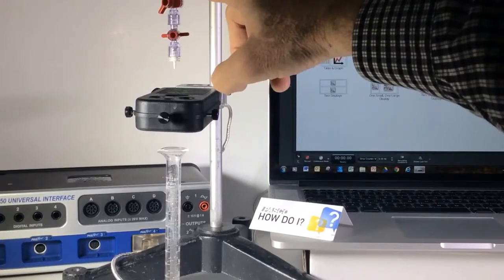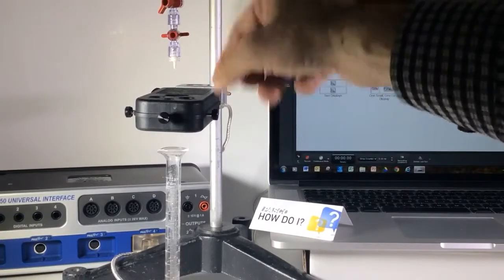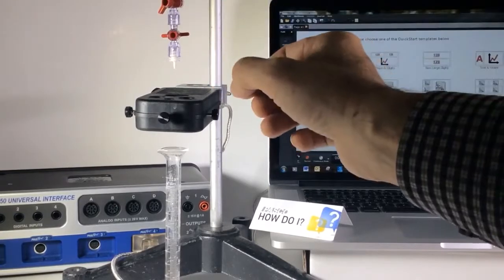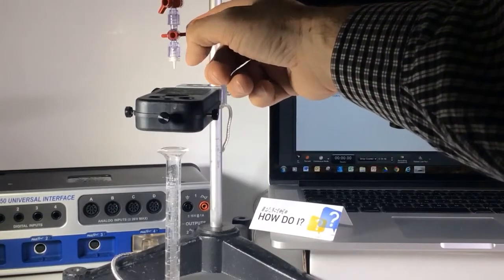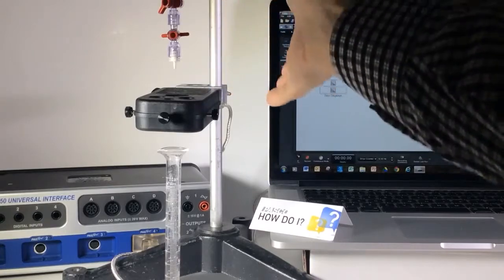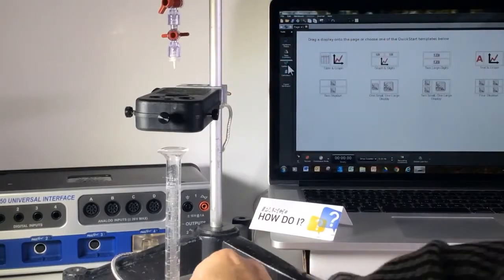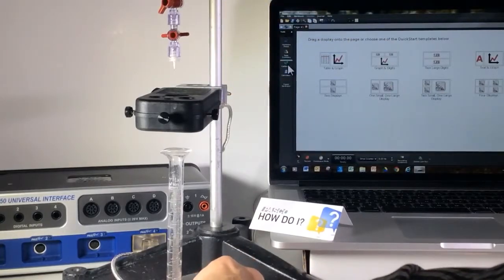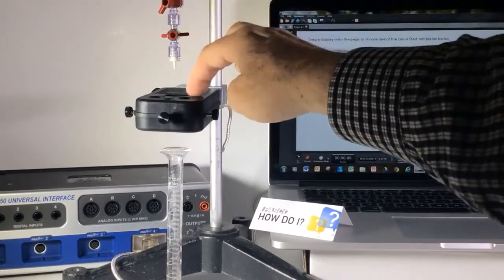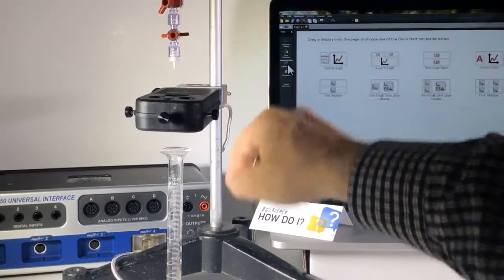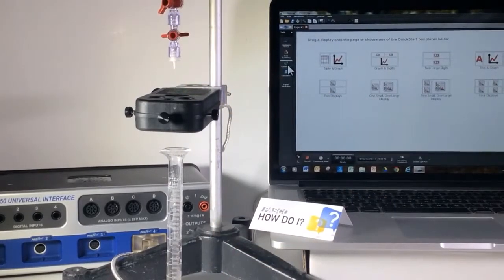I've adjusted the top stopcock for a nice even drip rate. The bottom stopcock basically just turns it on and off. I've also placed a graduated cylinder underneath so that the drops go through the drop counter and into the graduated cylinder.